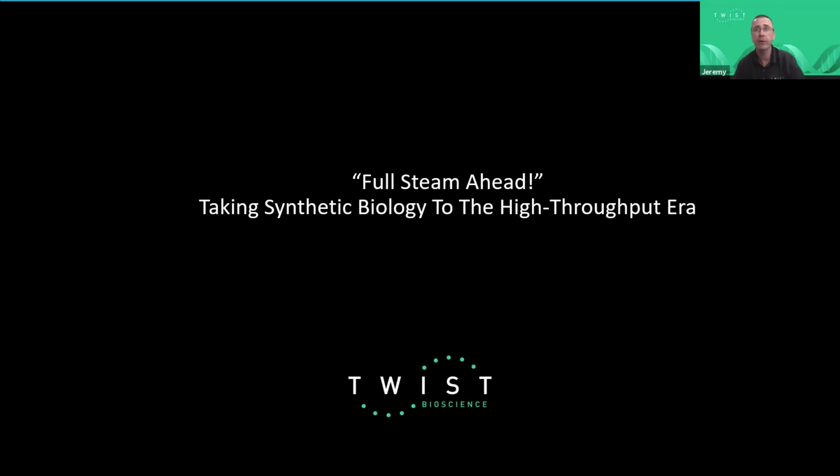Great question from Philip. How have you approached predictable scaling of bioprocesses utilizing engineered strains? What is the largest scale you have of your study? Scale as in a volume of, sorry again? I would say in terms of size. Of the volume of the culture, or how many samples do we process? I'll answer both probably. So we can easily process a couple hundred samples per week, most probably, when it comes to production of the genetically modified organism. And then it depends what you really need.